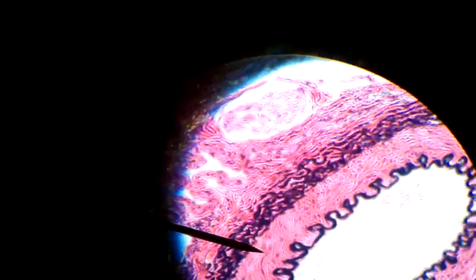In between that is the interna right here. Between the two purples? Yes. And then the outer purple is the externa. We have the lumen, the interna, the media, and the externa.